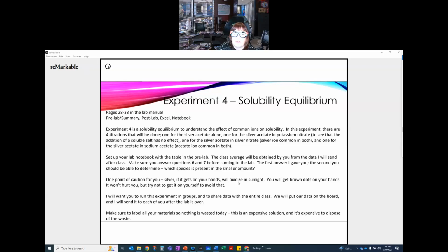Hey guys, welcome to our brief intro to the solubility equilibrium lab. I will record, as always, a separate video about this particular experiment, but I wanted to walk through what we have here. Now, there is no Alex for this particular experiment because there's nothing equivalent in Alex to what we're doing. So all you have is the data that's been given to you and the information from the lab manual.